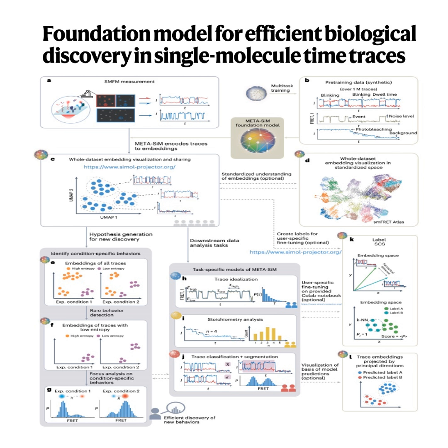That makes a lot of sense. So what specific skills did it learn during this massive pre-training? What were the tasks? It learned all the core things you'd want to do with SMFM data all at the same time. Classifying traces, segmenting them into different parts, analyzing photobleaching steps, kinetic fingerprinting, which is about measuring the actual rates of transitions, and importantly, trace idealization.